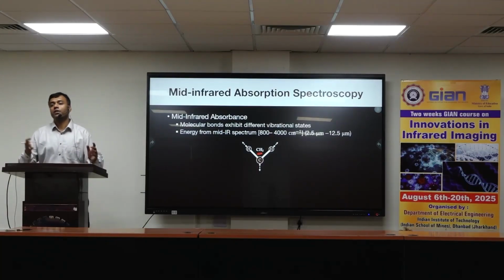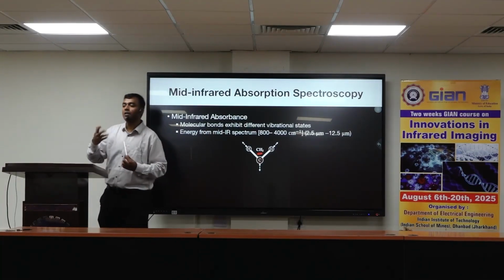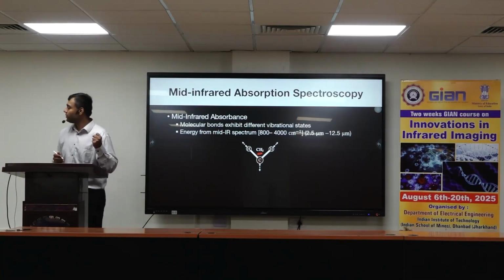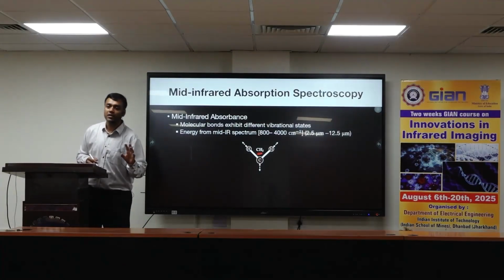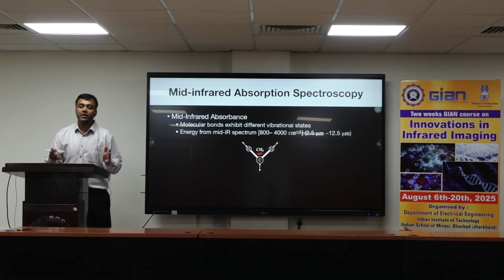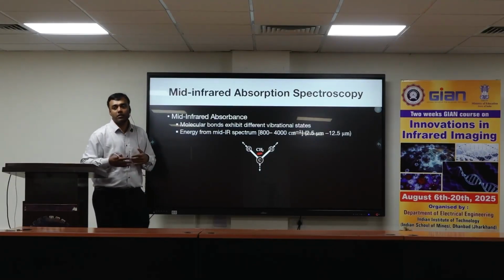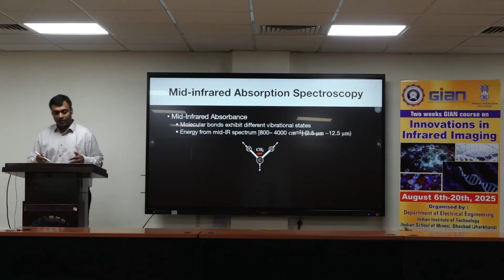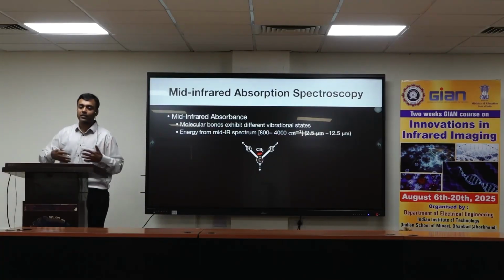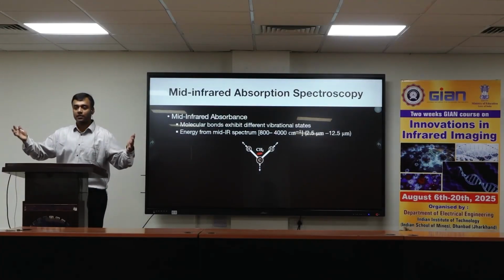Say, for example, a forensic person goes to a crime scene and finds some unknown chemical. They can bring it to a lab, put it under this vibrational spectroscopy instrument and make a spectral measurement. People have developed databases of about 125,000 to 150,000 chemicals, and each of their spectra has been measured.